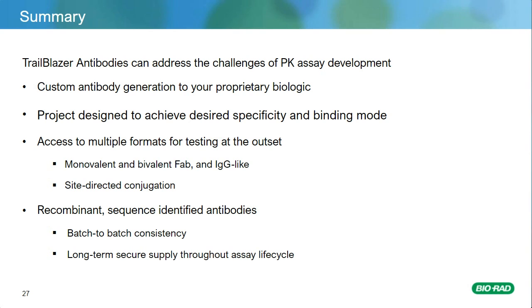But in addition to that, think about all the formats you may require the antibody in. And once you've finalized which clones you want to take forward, any validation requirements you may have, because what you might find is that we or other suppliers out there may be able to fulfill a number of these requirements. And if it's built in from the early planning of the project, it's something that we can deliver as we work through it. So yes, I think that brings me to the end of the presentation.